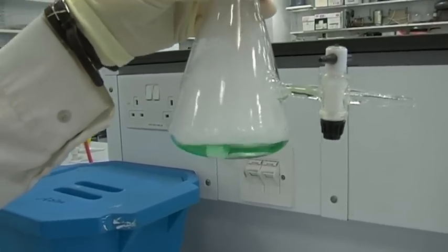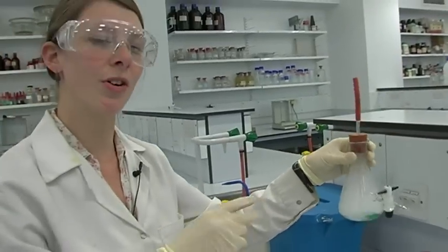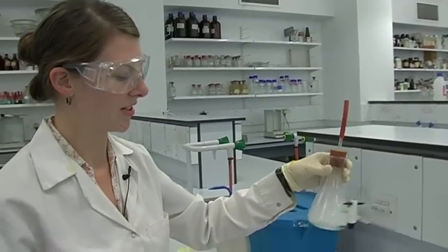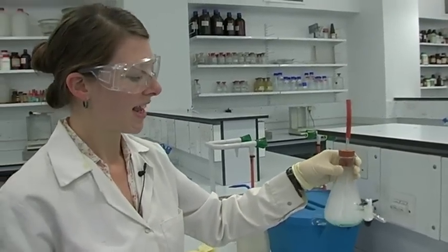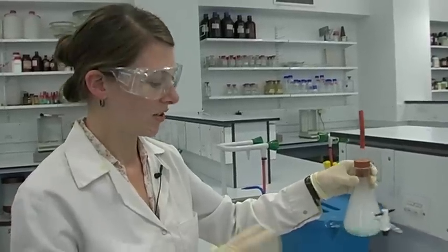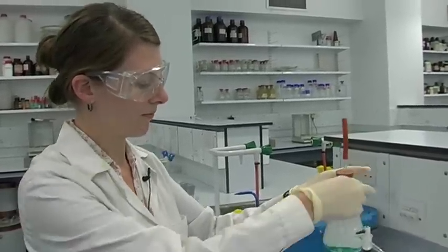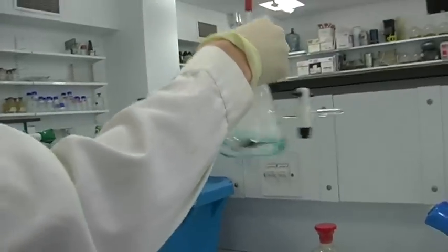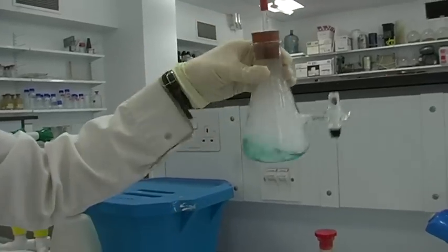That's not a distinctive color from an oxidation state change. That's actually two different oxidation states. We've got the yellow oxidation state of vanadium 5 plus and we're starting to get some of the vanadium 4 plus which is blue. So just mixed together they're looking green. It's gradually going more and more blue.